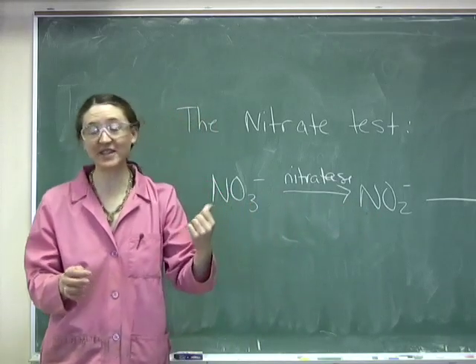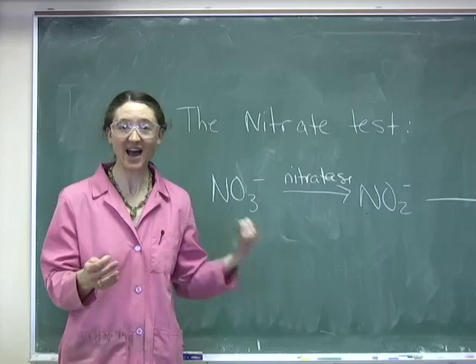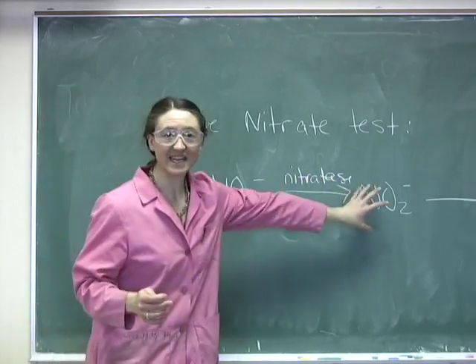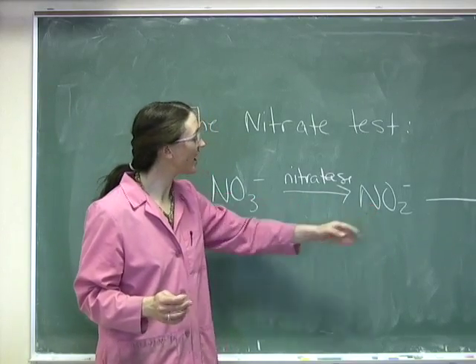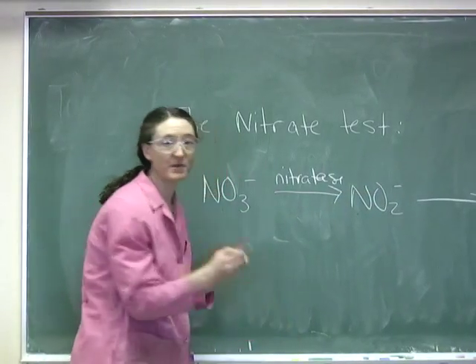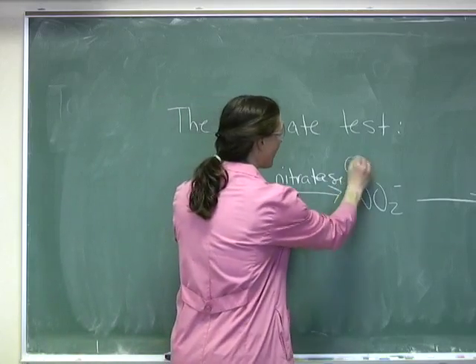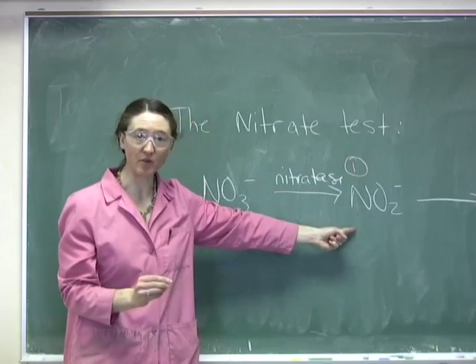We're going to see later this is a really important part of the nitrogen cycle. So many microbes that can do this help in nitrogen cycling. But one way that this can get done is that the nitrate can get converted to nitrite, and it stops there. So we could say that there are two ways to be positive. Let me label the positive ways here in pink. One way to be positive is to convert nitrate to nitrite and stop right there.